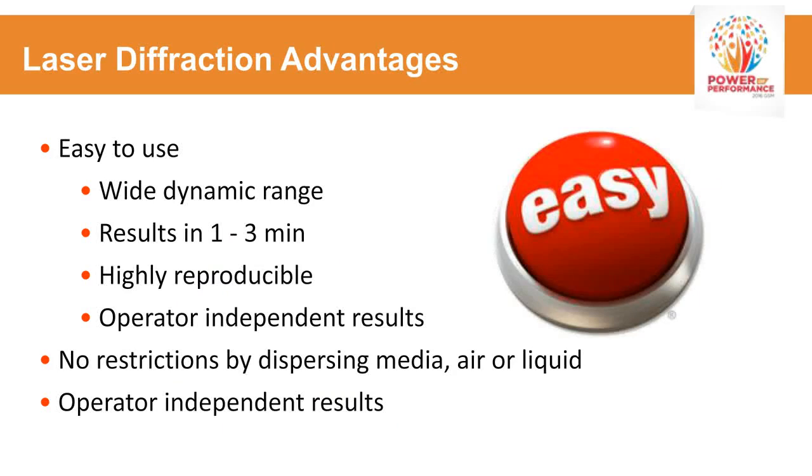Now, the advantages of laser diffraction are multifold. These instruments are quite easy to use. They cover a broad dynamic range. In other words, from submicron particles to usually multiple millimeters, so a couple of thousand microns down to below a micron. They can do this quite fast. Typically, results can be in 1 to 3 minutes, thereabouts. Could be a little longer depending on if running liquid systems.